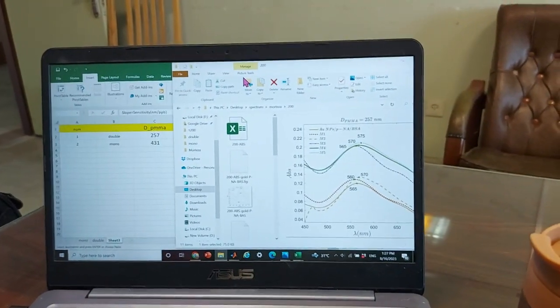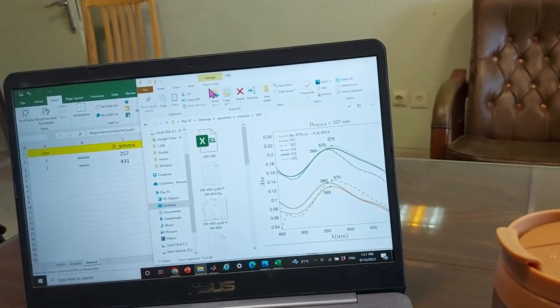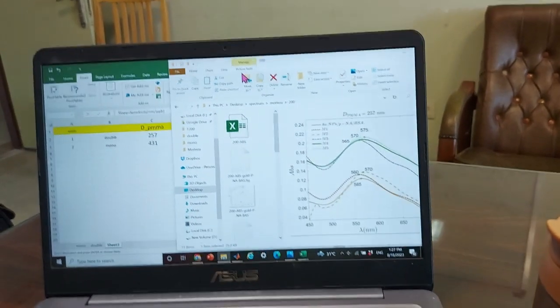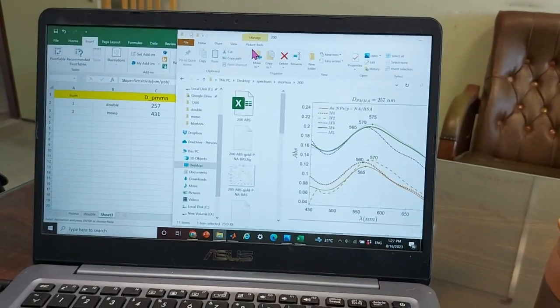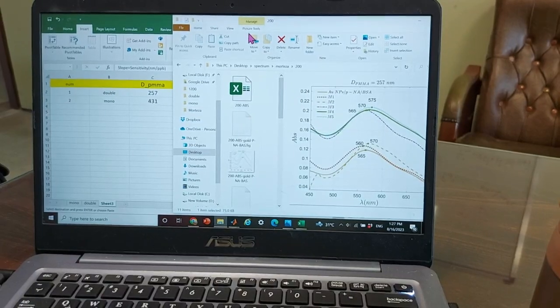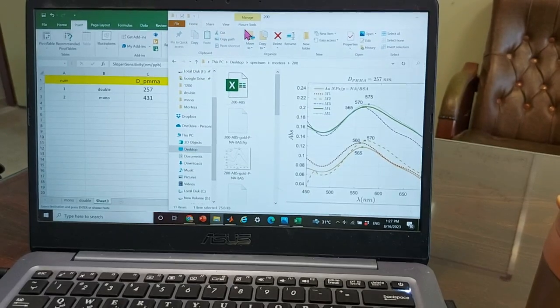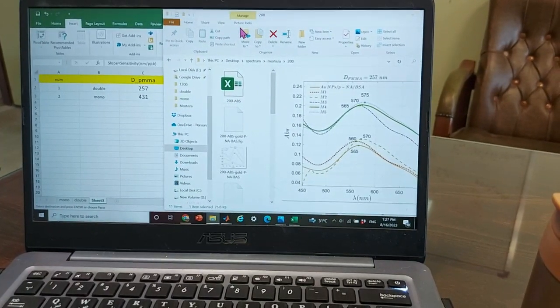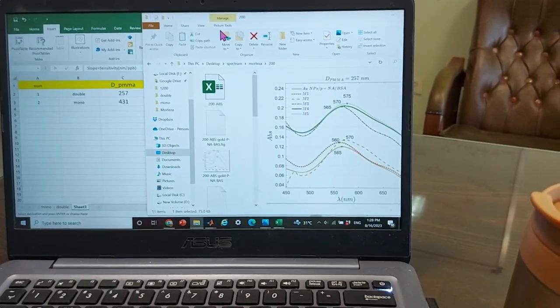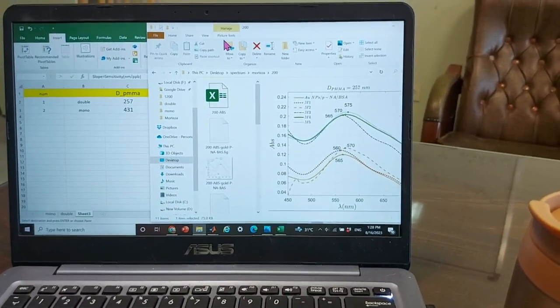If the sphere is about 50, then 50 for gold is a lot. We should deposit gold at most half of the diameter. If the diameter is 50, we deposit 25 at the end.